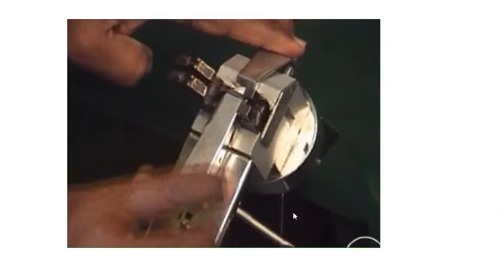This is the clamping vise, the total setup. The two jaws are placed in the clamping vise. You can see the space between the two jaws, with an insert. So the total length is 15 mm. The fiber length, that is the total length of the fiber, will be 15 mm.